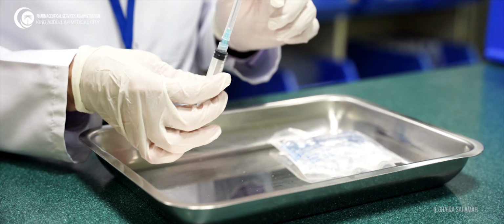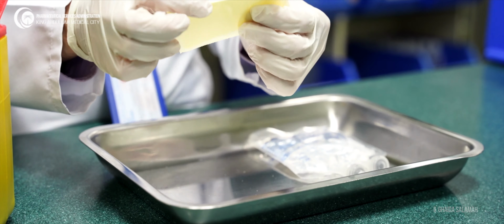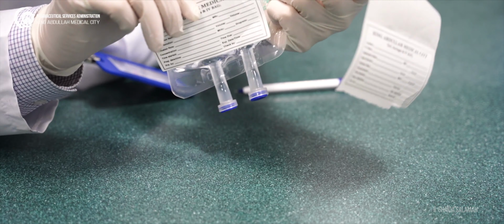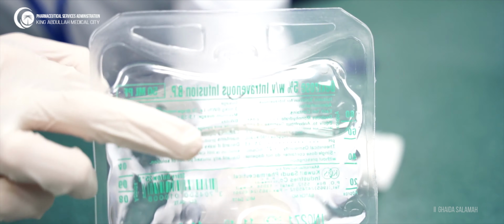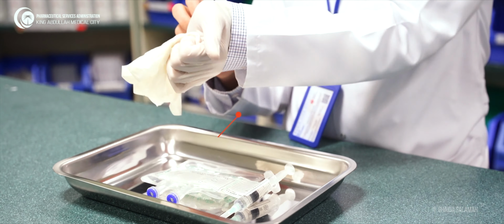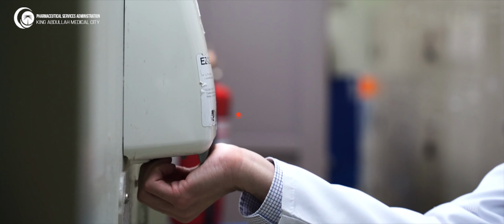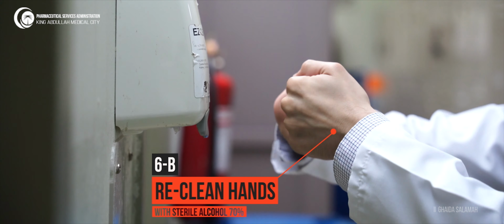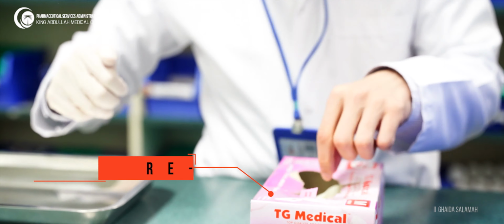Also, use the scoop method to cap, then discard sharp items in the sharps container. Then you should stick the label on the side of the bag which does not contain the information of the product. Then change your gloves after preparation. You'll discard them in the medical waste. Then rub your hands with sterile alcohol 70%. Then put on new gloves again.